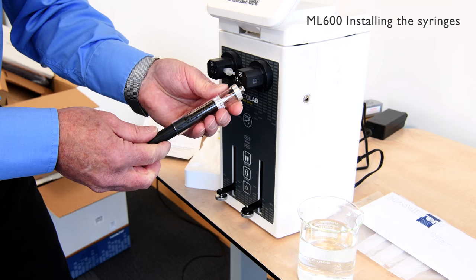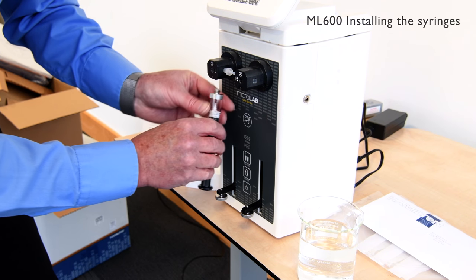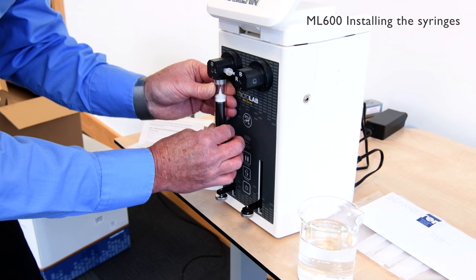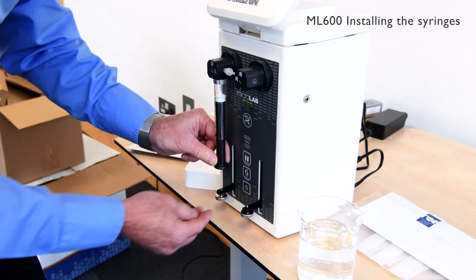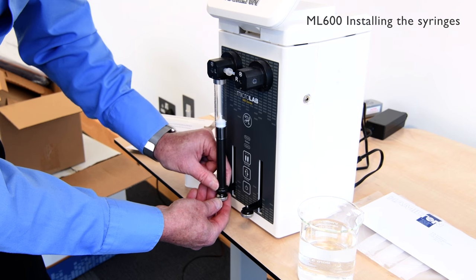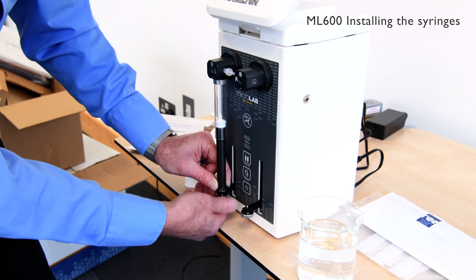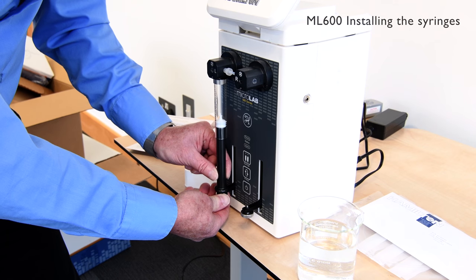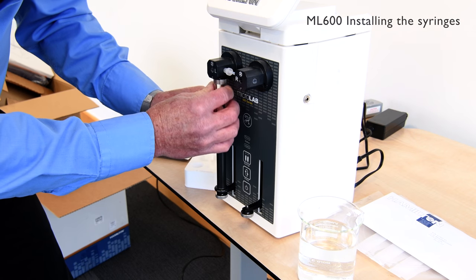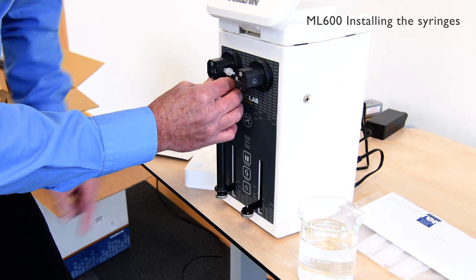Once we've done this, we can now introduce the syringe to the valve, and likely secure the top to the valve itself. Then we depress the plunger to bring it back into line with the foot plate, and a screw connection on the bottom of the syringe. Once we've secured the bottom of the plunger correctly, we do no more than one eighth turn on the top to ensure the syringe is fitted correctly to the valve.